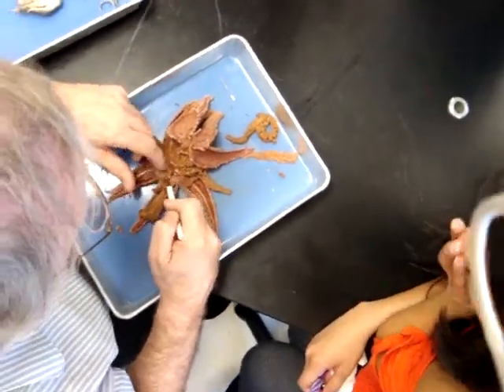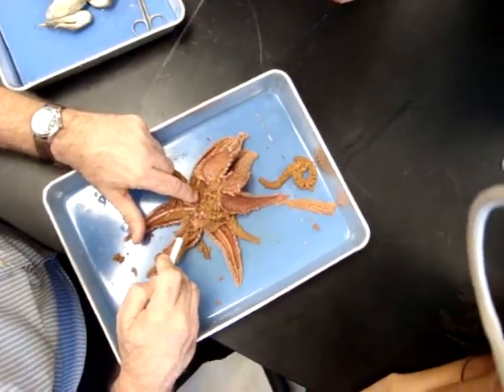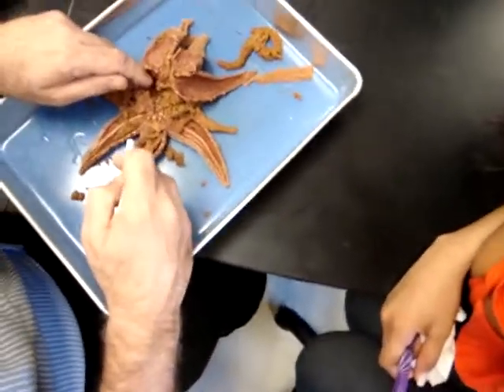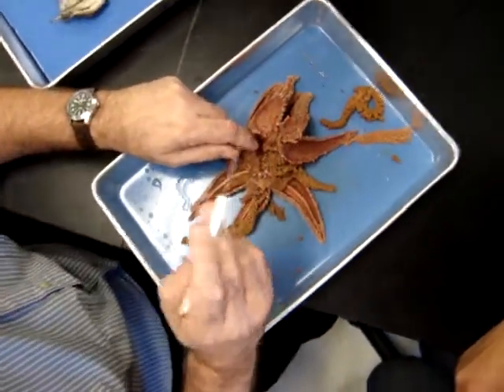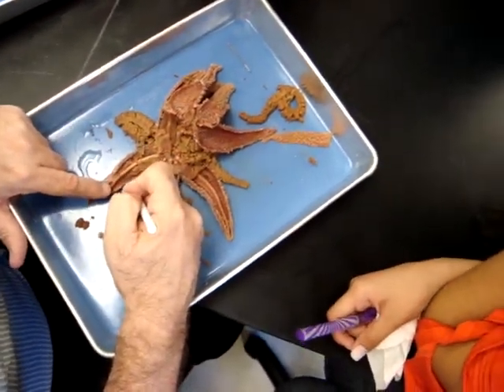So, ring canal, got it? I suspect the stone canal may have been attached right there. Stone canal, ring canal. Out to what canals under here? Radial. Out to the radial canals, because the lateral go that way. Lateral canals to the what? Tube feet, podia. Podia and then tube feet.